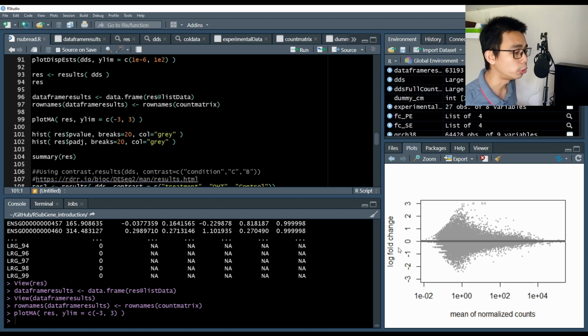And we have the log fold change over here. Anything that is positive means, for example, a 3-fold increase in the count number. A higher number means they express more, minus means they express less, and it's usually calculated in log2 because it's an easier way to understand fold change.